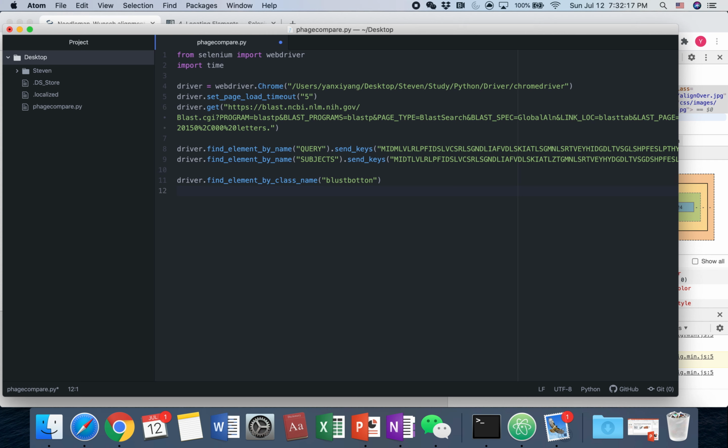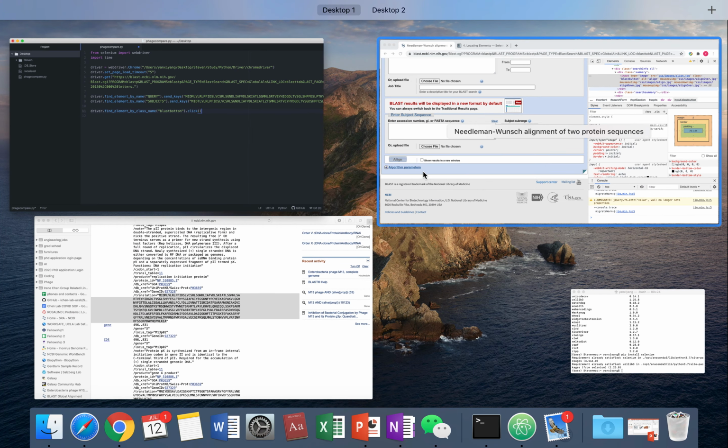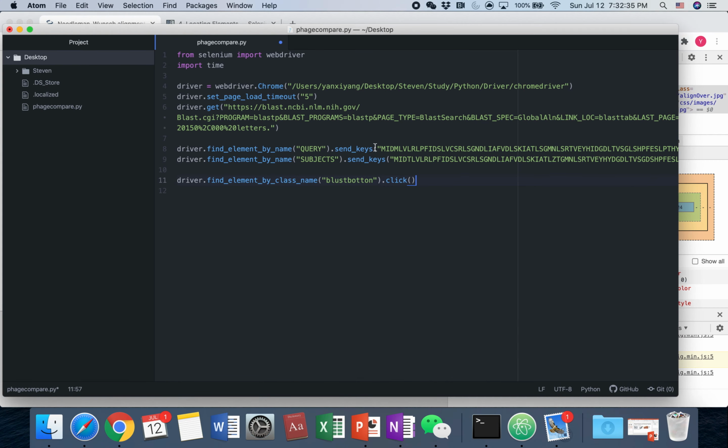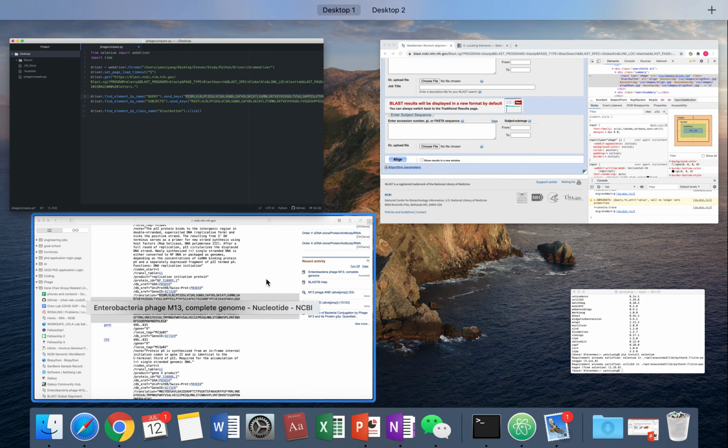All right. So now I have this. I want to click it, so you do dot click. The thing now is, you already input these two buttons: I'll click, type in, I'll click. So let me just copy this and see where we want to go right after this.